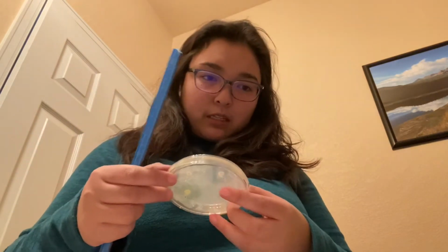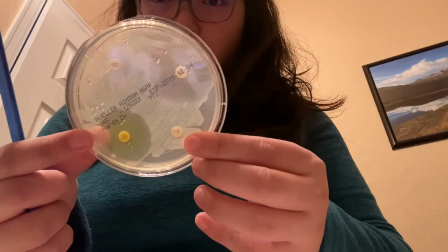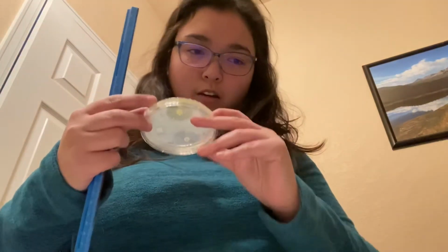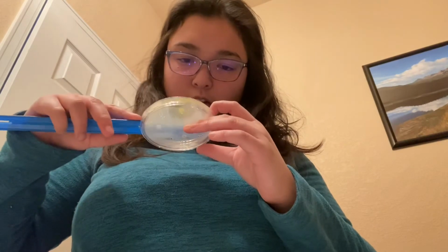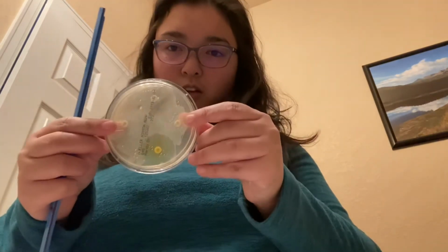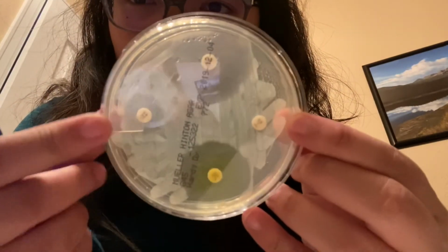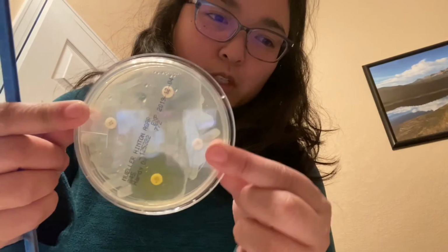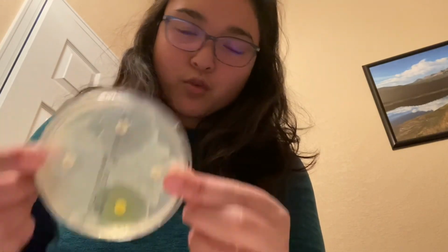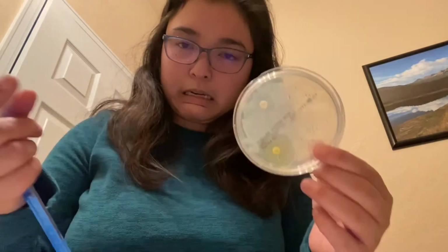And then the last one, which is the oxacillin, is this one. It looks like that was the one that didn't have any reaction. Just from looking at it, it didn't have a circle around it at all, compared to these other 3. So I'm going to assume that means it is resistant to it. So that was that, and I hope that's it.